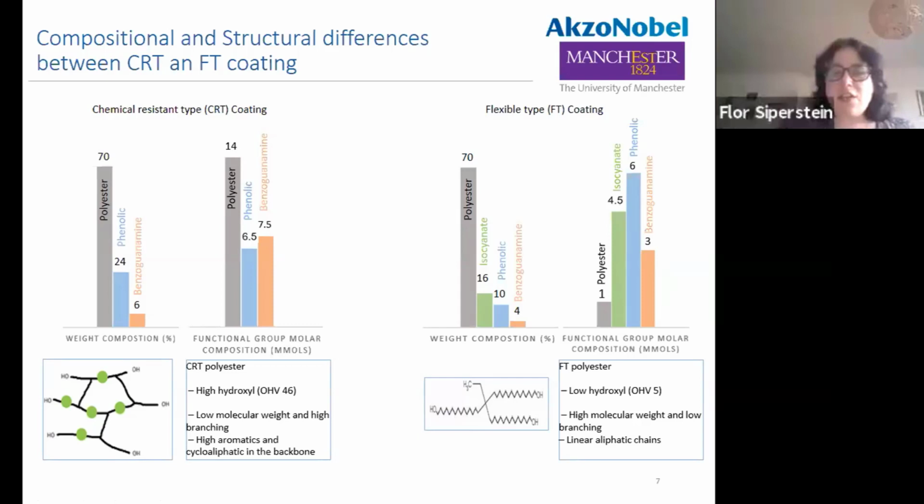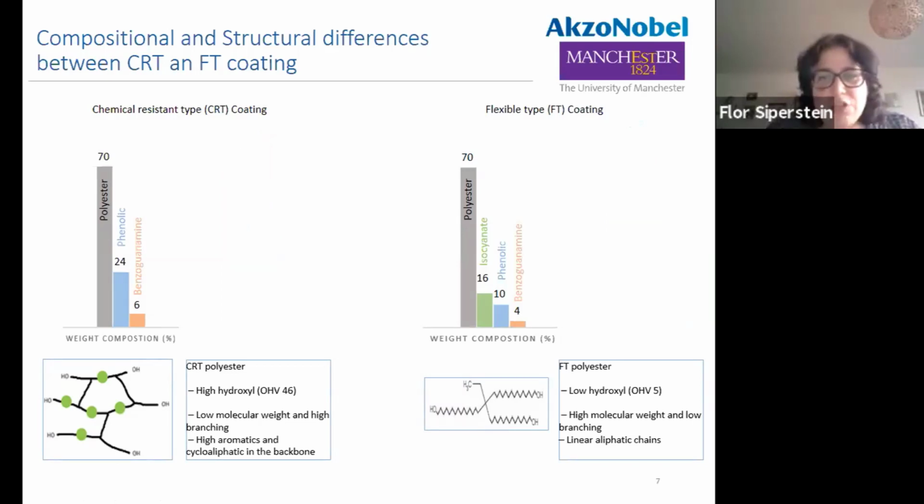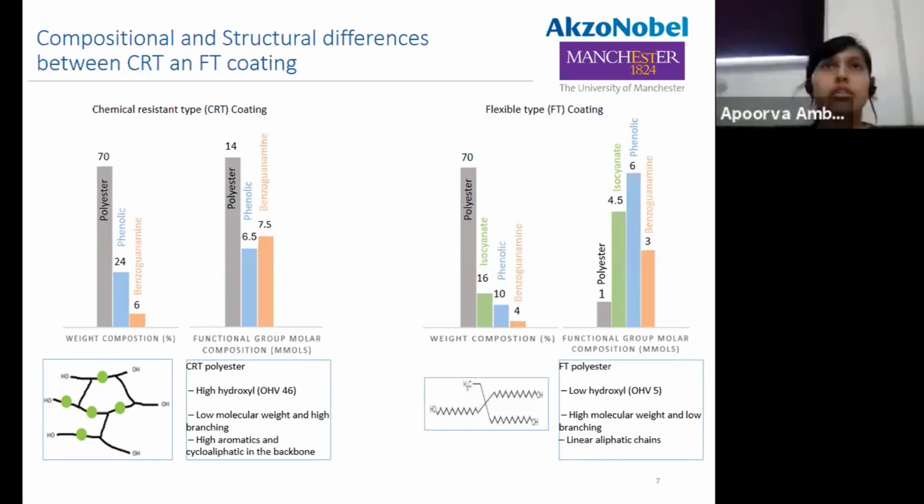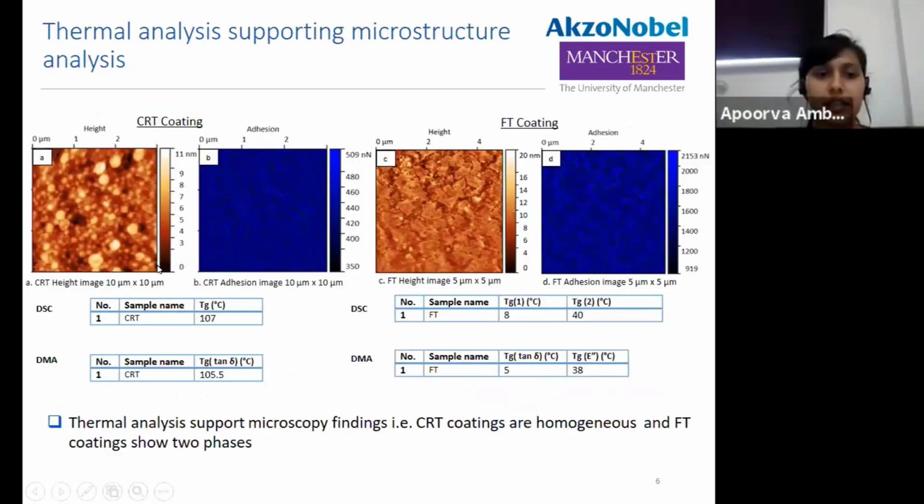Okay, there is another question for your presentation. Do you think that in some AFM images at the beginning of your presentation, the disrupted morphologies are caused by air release? And did you use any leveling agent? So there are no additives in the formulation. Indeed, in this type of morphology, it could be something like what the question suggests, and we have not used any leveling agent because it doesn't come up in the stiffness value. So it probably is more of a physical phenomenon from maybe solvent evaporation or something.